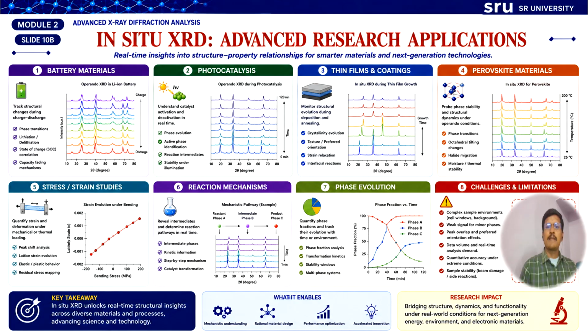Finally, let us discuss the challenges and limitations of in situ XRD. There are a few challenges here. One is that in situ experiments require specialized sample environments and highly stable instrumentation.